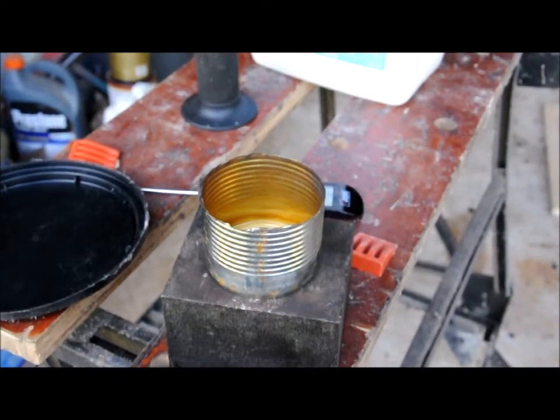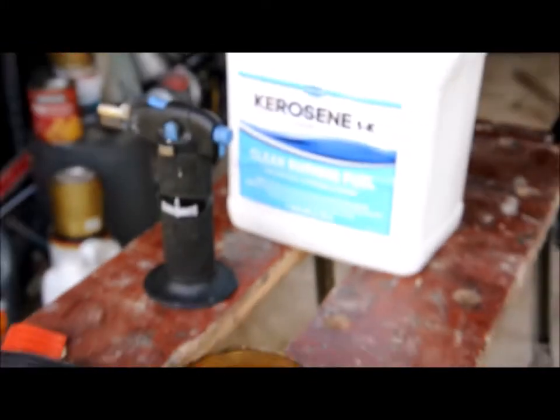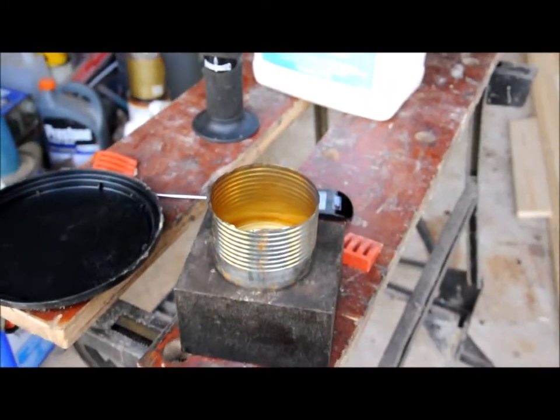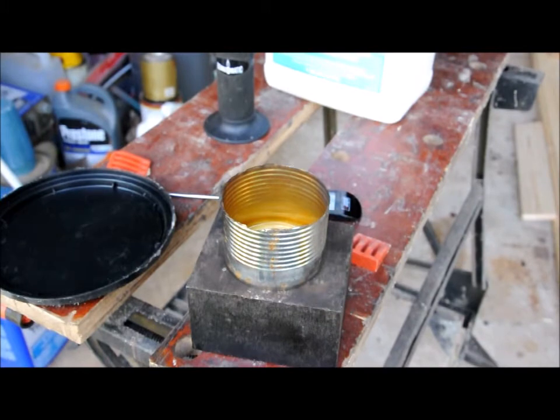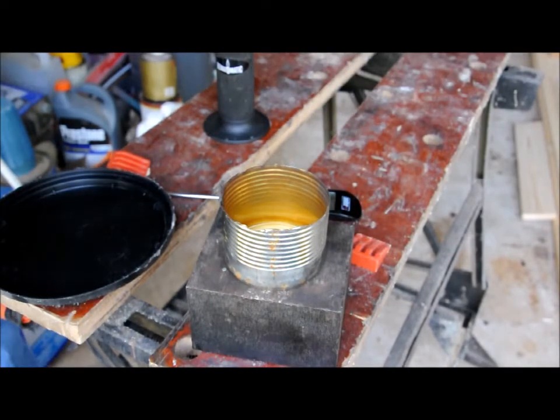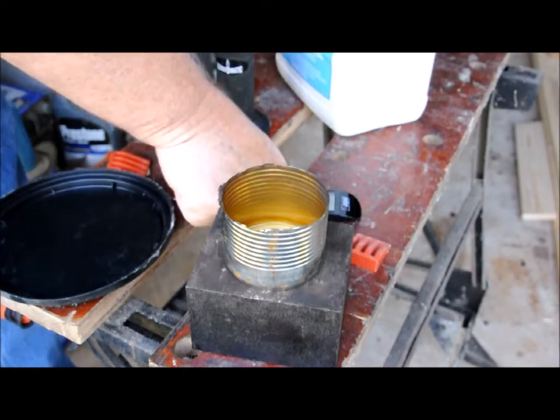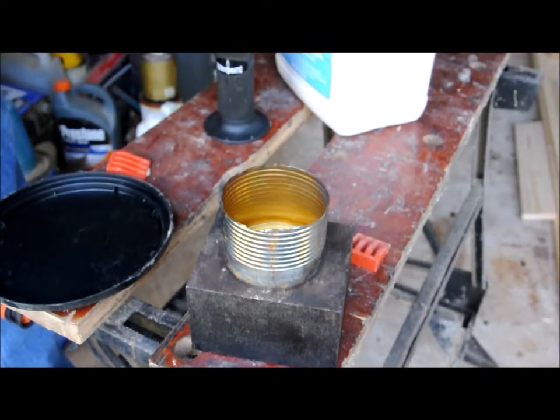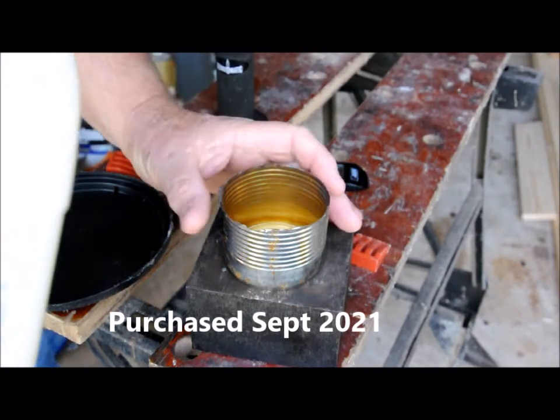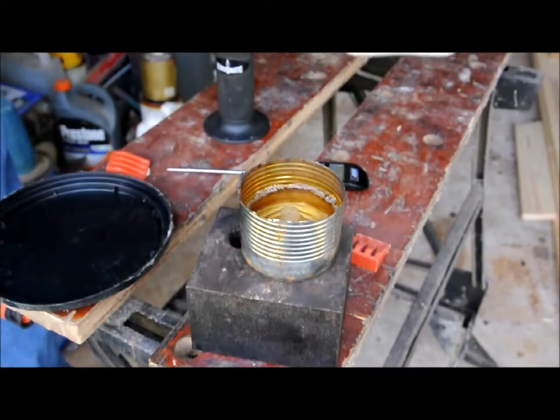I'm going to do a flashpoint test today on some new Crown 1K kerosene. Let me pour some into this cup and we'll get started. This is a new container I just bought. Don't need a whole lot.